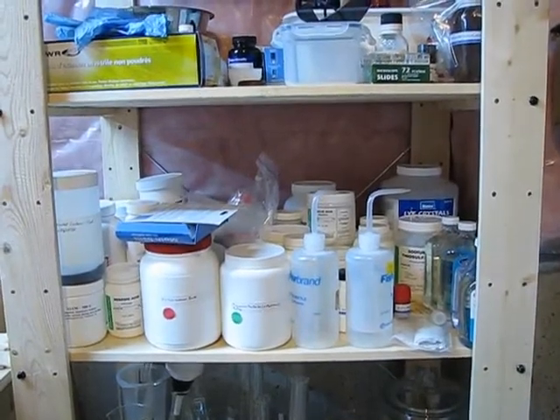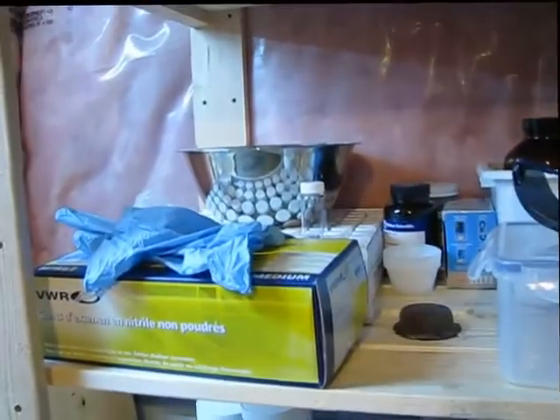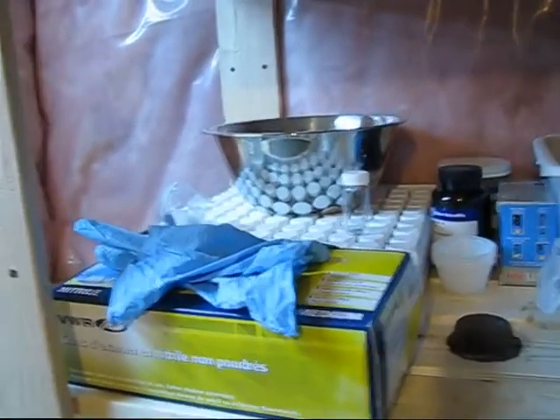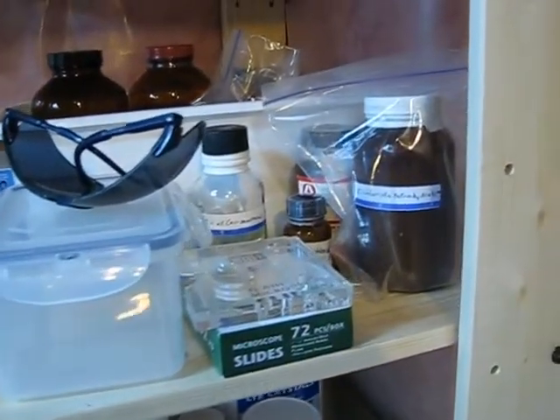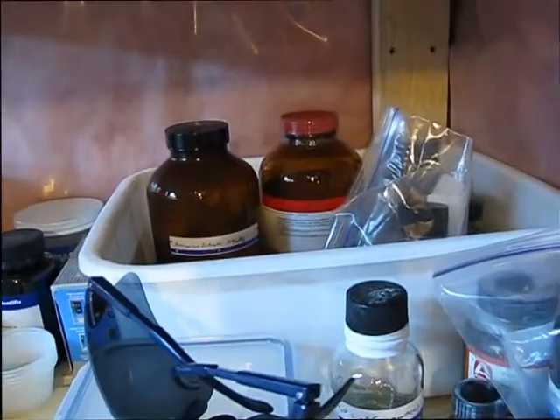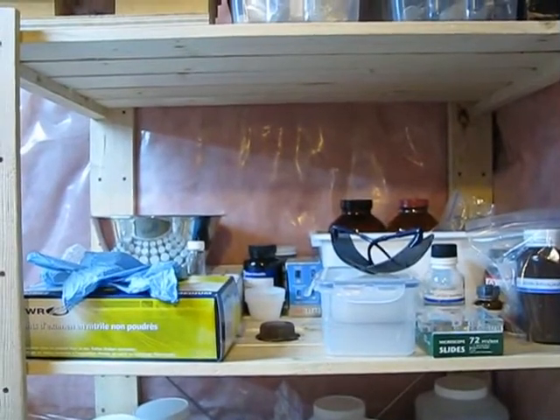Nothing really reactive. Up one level we have a split — one side for equipment and miscellaneous things, and the other side for chemicals: gloves, sample vials, heating bath, boiling chips, a makeshift desiccator, and microscope slides. Reducing agents over here, oxidizing agents over there. They probably shouldn't be stored too close together, but they're all contained so nothing really will happen.